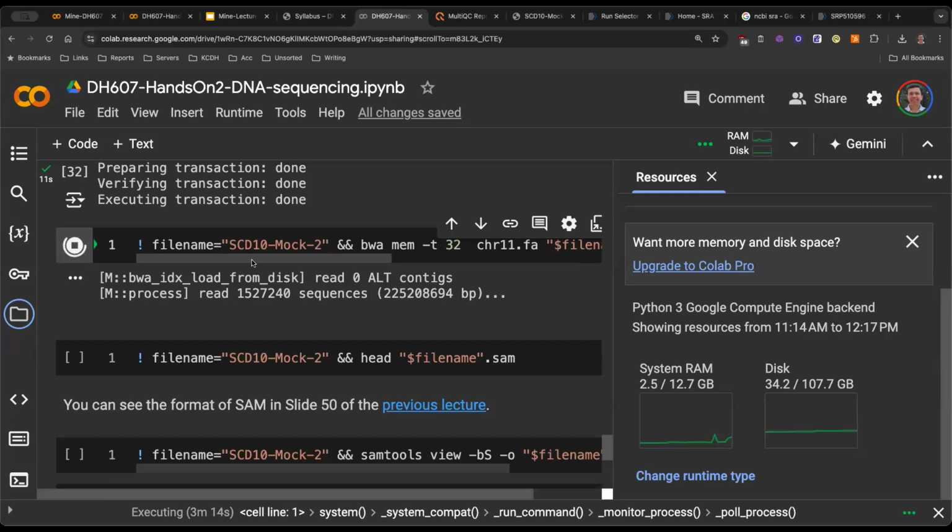So very briefly, what it is doing is it loaded that BWT index into memory. It is now reading inputs from the FASTQ file and figuring out where each read belongs, right? It will ideally not load the entire FASTQ file in memory because that doesn't really make sense. So you read it record by record. The reason you can do this is because you know the format: every 4 lines is one record of the FASTQ file.